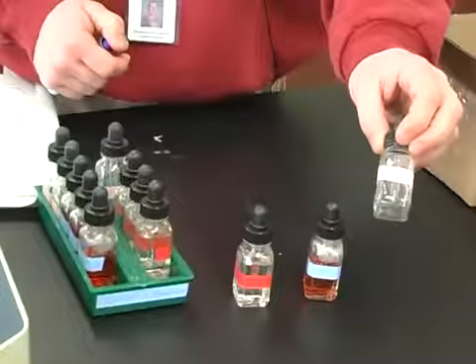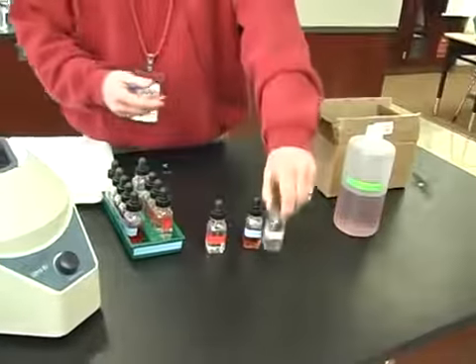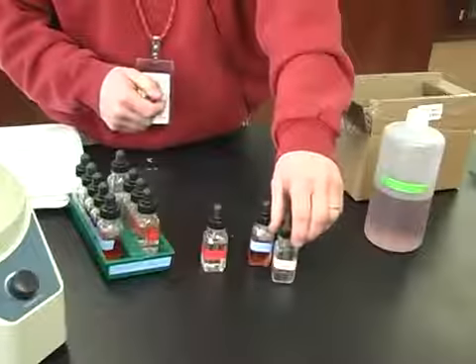But this, for instance, would be the 6 molar H2SO4. 6 molar is fairly concentrated sulfuric acid. It's not something that you want to leave the cap ajar on and leave it sit like this at your lab station. So safety and care is really, really important in this lab.